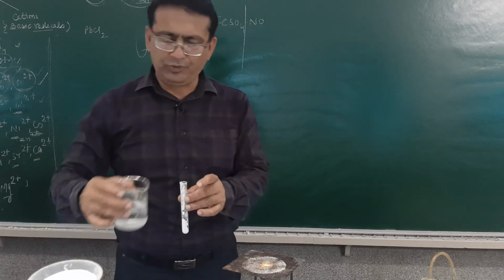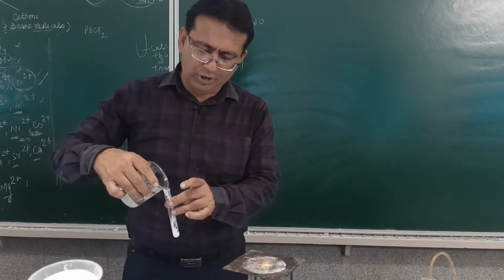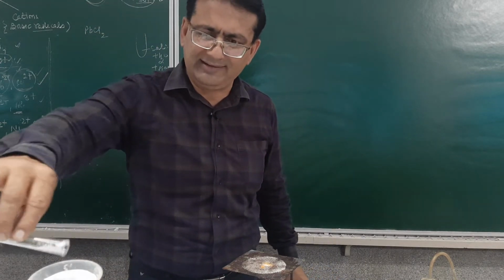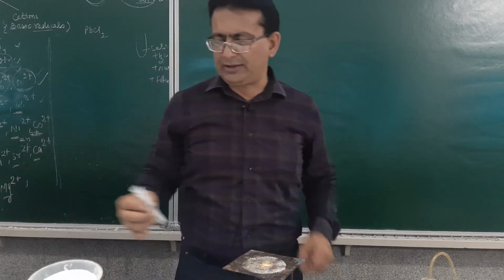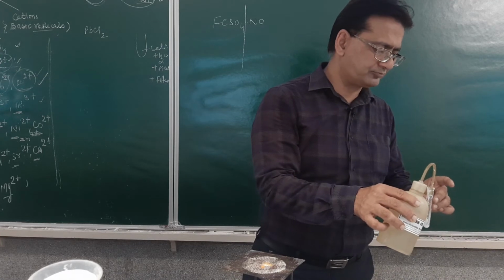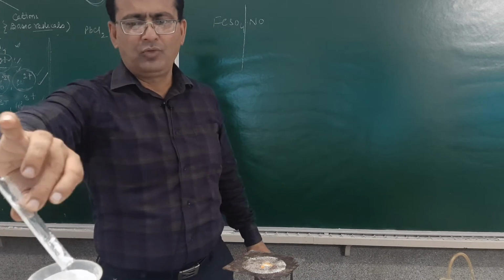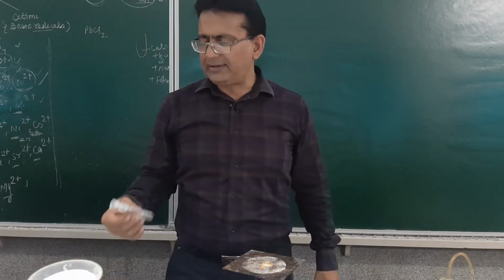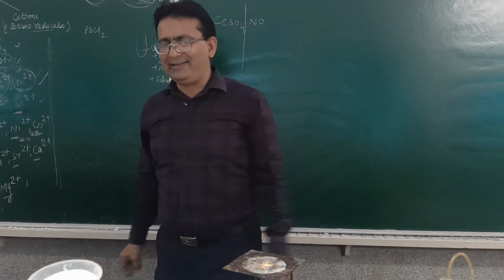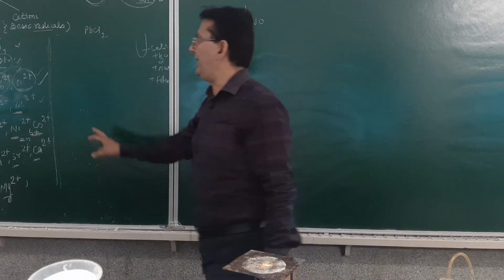The filtrate will be kept for the second group. If the first group is present, you need not go into the second group, but in the examination you may be asked to at least write down the analytical table, so that can be done over there. Is it clear? You may see it has started filtering. Can you see that? Now, once you filter this, collect the residue for the analysis of a cation. I'll be analyzing the lead ion in this.